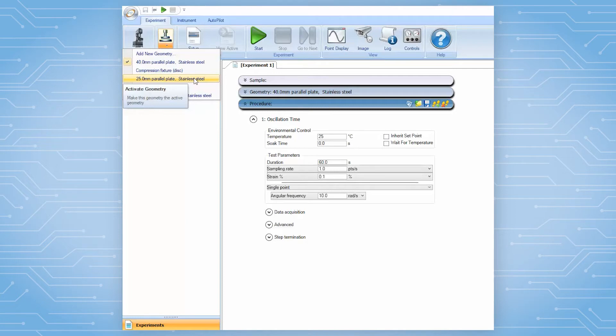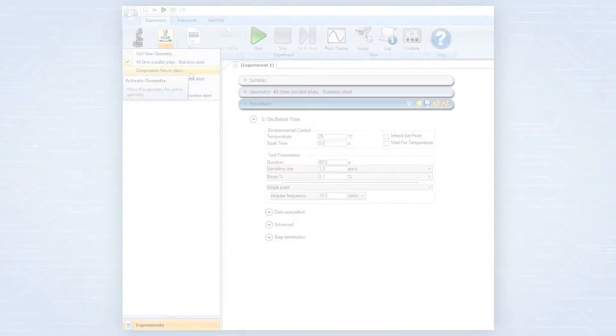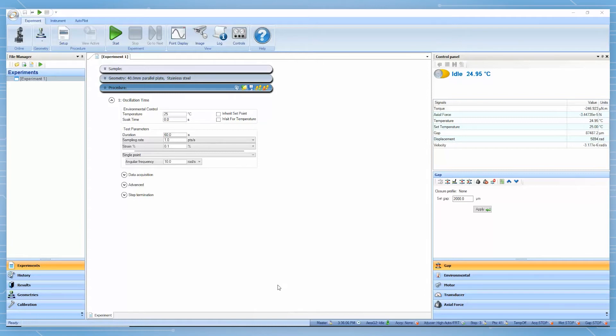For compression testing, the operator needs to select compression geometry so the instrument will move in axial compressive mode. If this compression geometry file has not been created previously, then the operator will need to create this geometry file before performing any compression testing.